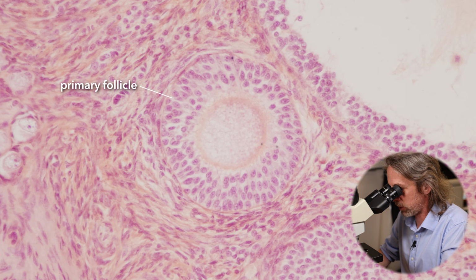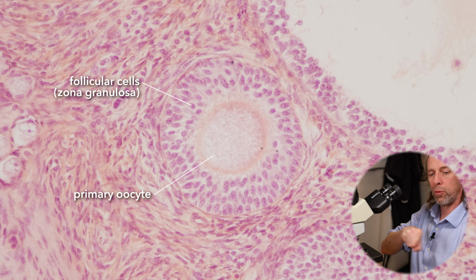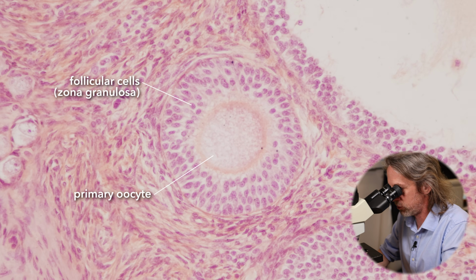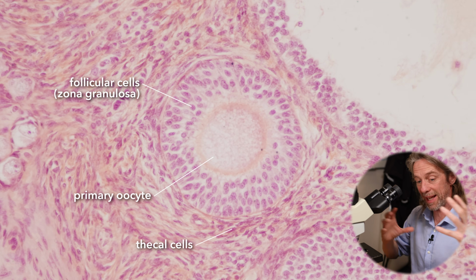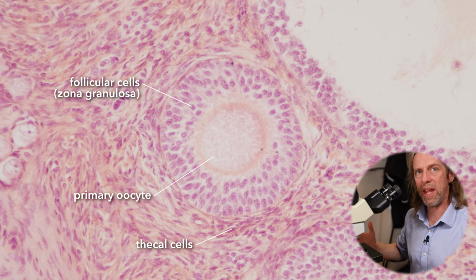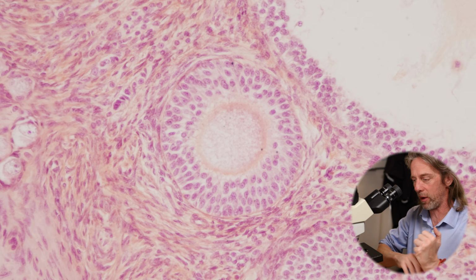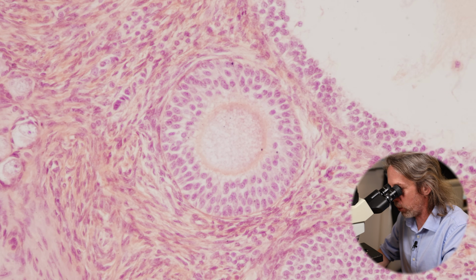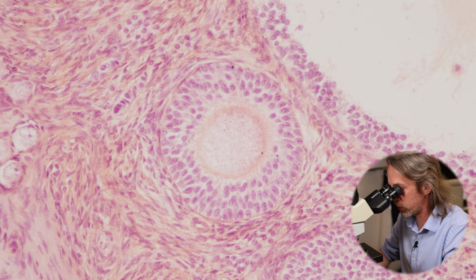And now we've got multiple layers of follicular cells, granulosa cells. That oocyte in the middle has become much larger. And can you see there's a ring of cells running around the outside of those granulosa cells on the outside of the follicle. So those are cells from the stroma, so the cells of the tissue of the ovary. Those cells are becoming thecal cells. Now, thecal means like a sheath or a box. So these are the cells around the outside, and these are going to be cells that support the follicle as it grows. So that's still, I would say, a primary follicle.